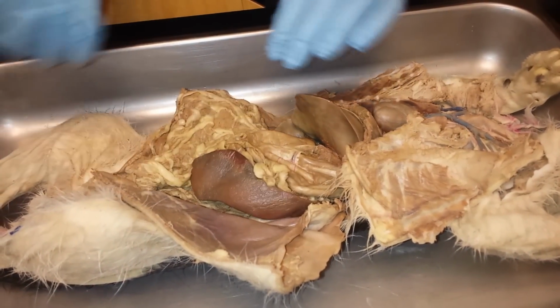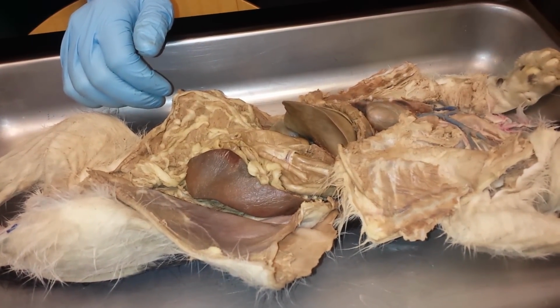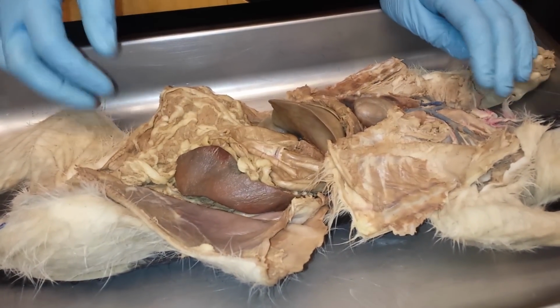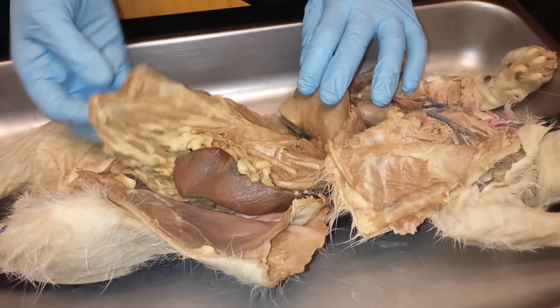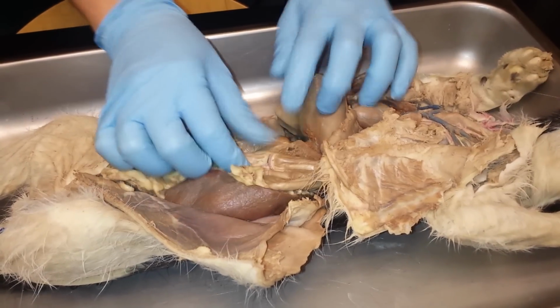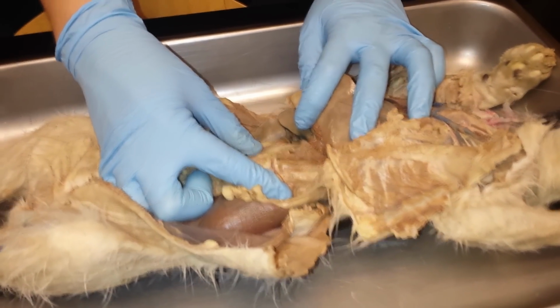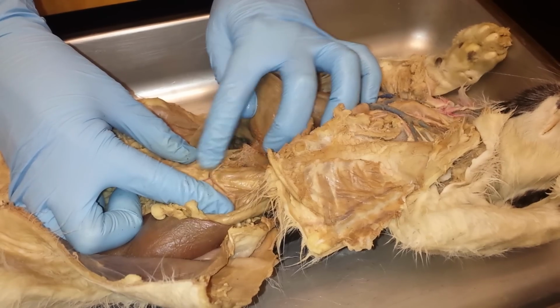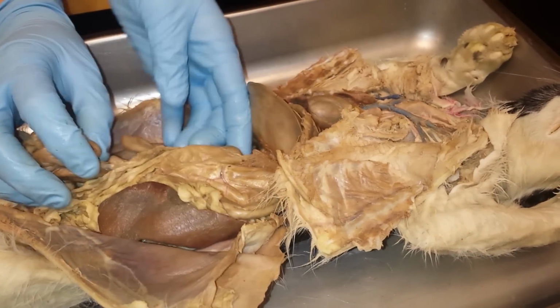But the abdominal pelvic cavity doesn't have a thoracic cage like the thoracic cavity does. The thoracic cavity has ribs and hyaline cartilage to protect those organs. The abdominal pelvic cavity doesn't have that. So this greater omentum helps with protection and cushion. This fat that's embedded right here in the lesser curvature of the stomach, that's the lesser omentum. So lesser omentum in the lesser curvature, greater omentum attached to the greater curvature.